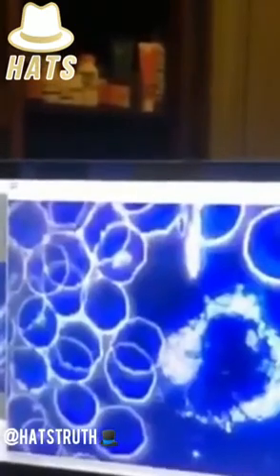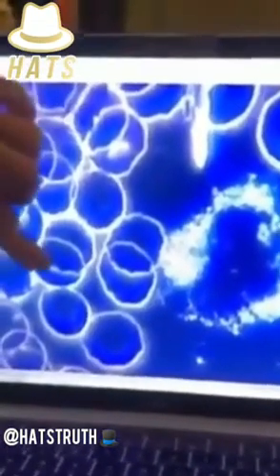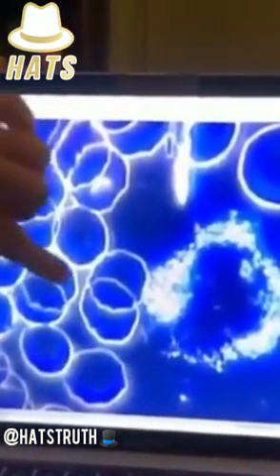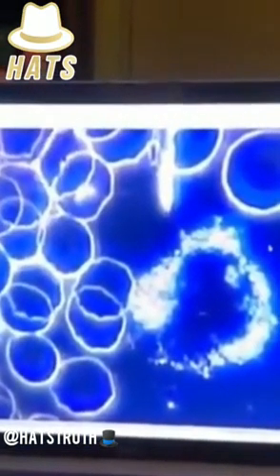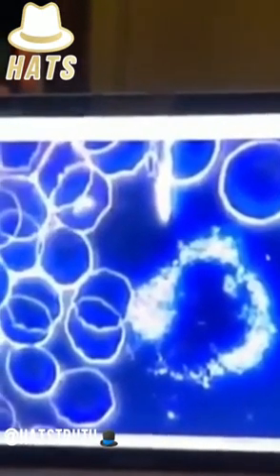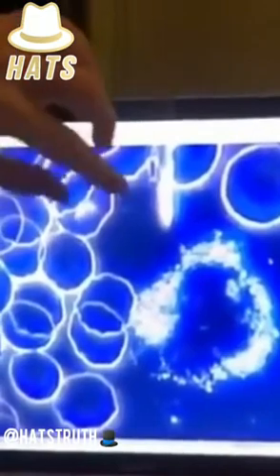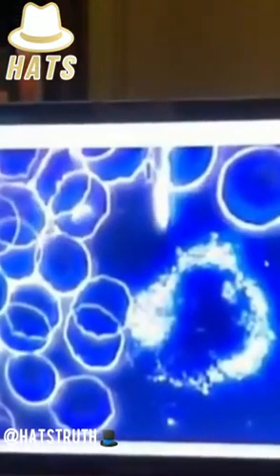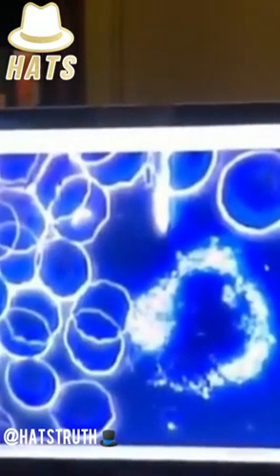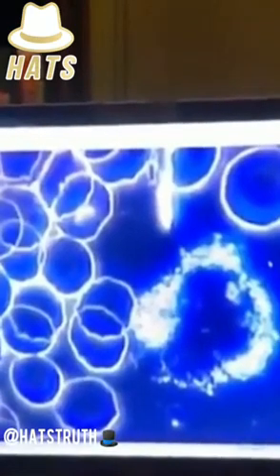Yes, definitely nothing organic. Nothing organic. I took it because you can actually see the cell surfaces here are really not healthy. So the cell membranes are not healthy. That's usually happening if there is some intoxication or something happening. And this is actually a white blood cell which is completely destroyed, which I have only seen in people after receiving chemotherapy or some kind of similar treatments that were very toxic.